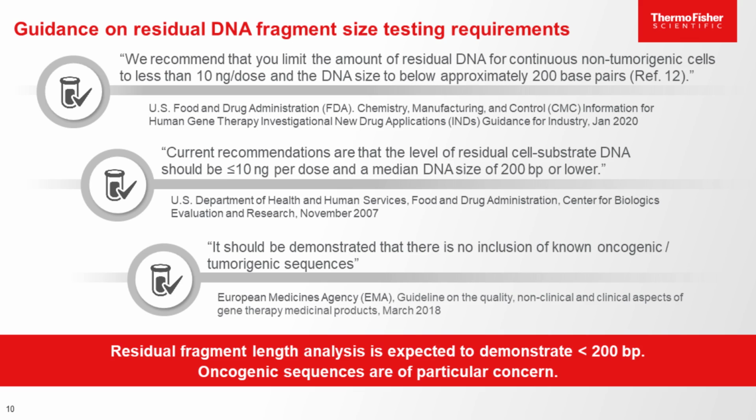So why should you be concerned with the amount of residual DNA left in your product? We know that residual DNA can impact product quality, efficacy, and safety. Regulators around the globe require you to limit the amount of residual DNA in the final dose. The World Health Organization, for instance, indicates that the amount of residual DNA per dose is kept below 10 nanograms. Residual plasmid is part of the 10 nanograms per dose limit, along with host cell residual DNA. They also indicate a size limit of 200 base pair for residual DNA, therefore expecting a robust and validated method for residual DNA fragment sizing analysis.